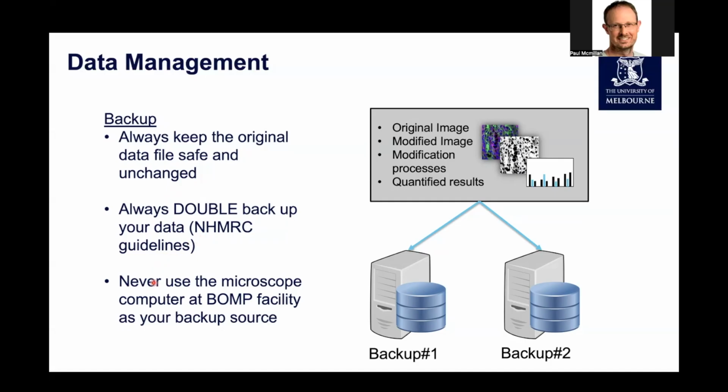And certainly within our facility, we recommend that you don't try and use any of our microscope computers as a safe place to back up your data. They have multiple people that can access them and could go in and change things or just delete the files completely.